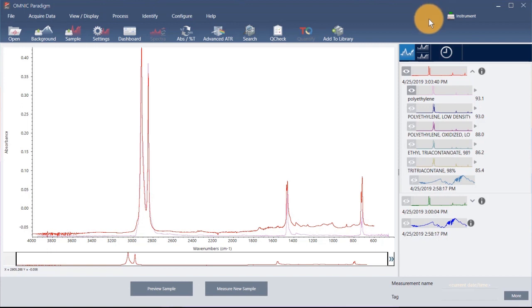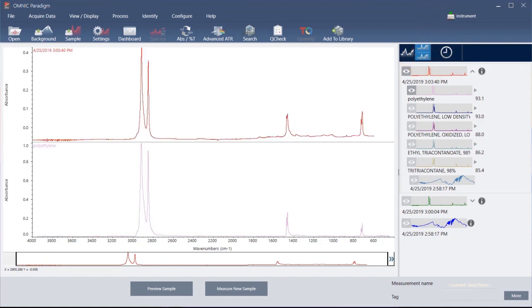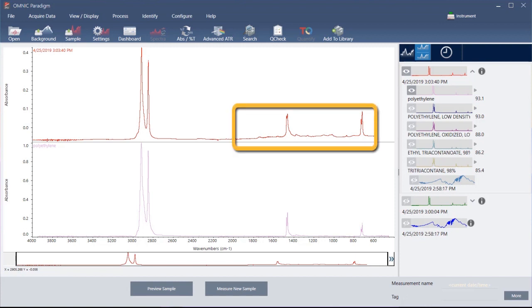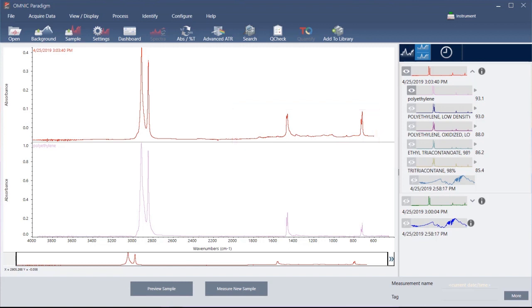Click the stack button to see the two spectra scaled to fill each y-axis. Again, the spectra are well matched except for the raised baseline in the sample spectrum's low-frequency region. As a result, we can conclude that the sample is polyethylene and the analysis is complete.